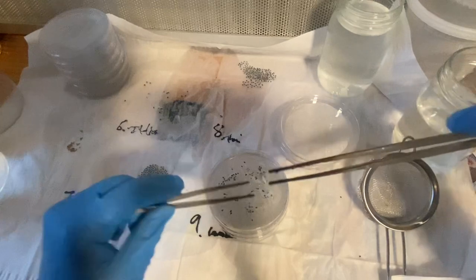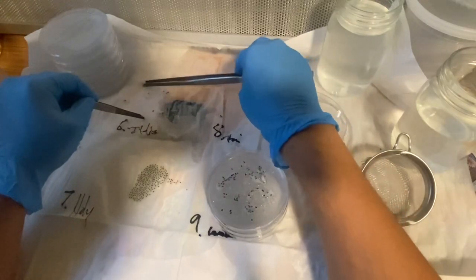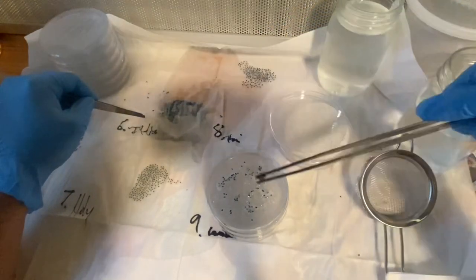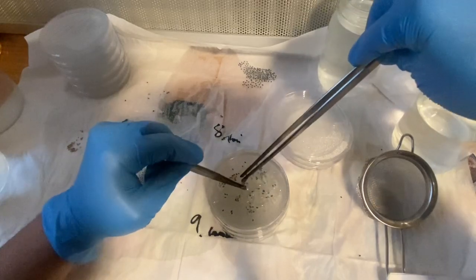So we're only going to do 3 plates, so you just add what I want to, and everybody else is a sacrifice to the tissue culture gods. Sometimes you sacrifice the tissue. Do what you gotta do.